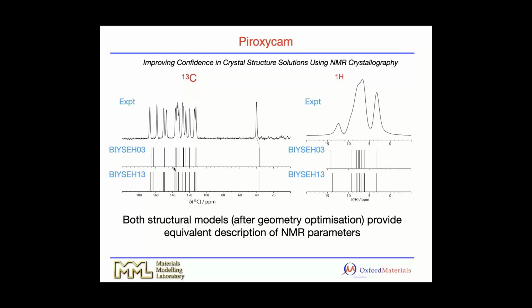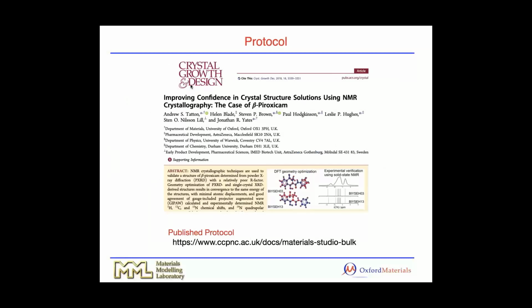But essentially what we're showing here is that we can improve the confidence in some of these structural models that come out by doing the geometry optimization to confirm that yes, this is a good structure for this material. Okay, so that was published in Crystal Growth and Design with the team from AstraZeneca and a number of other partners.